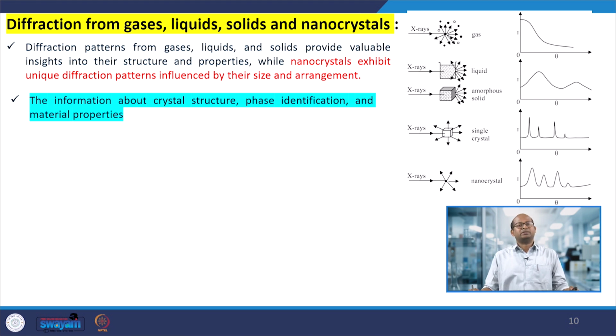In the case of gas, liquid, solid samples or nanocrystalline samples, the diffraction patterns will be different depending upon the material.